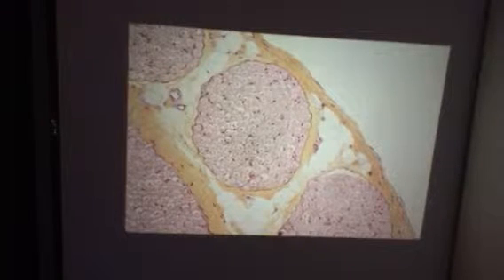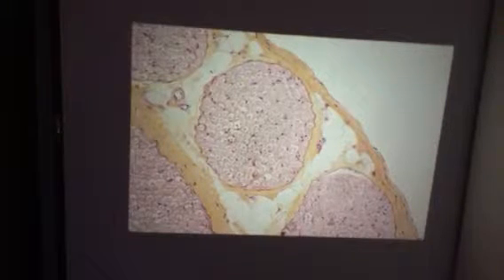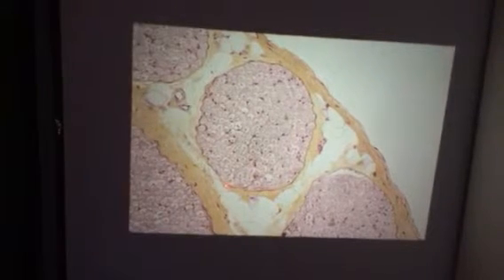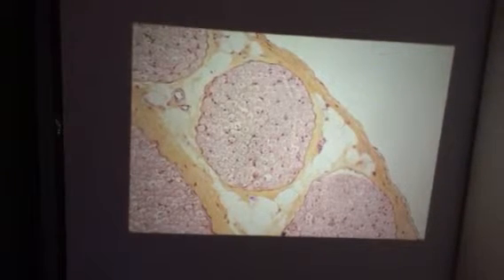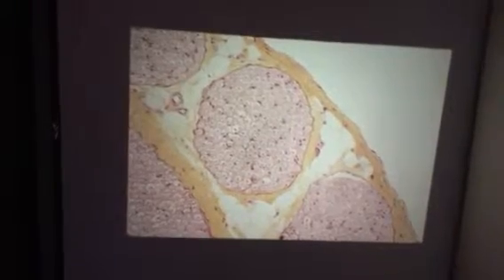Yeah, peripheral nerve. And so on the outside here, what would that layer be? Epineurium, and right here we're going to call this the perineurium, and then here we'll have a third layer which would be endoneurium. And then surrounding that axon would be what? Myelin sheath.